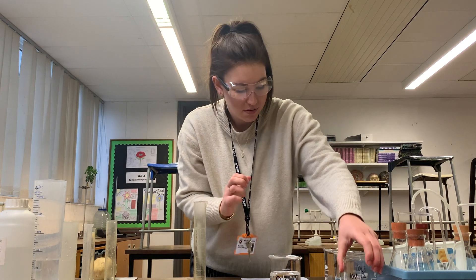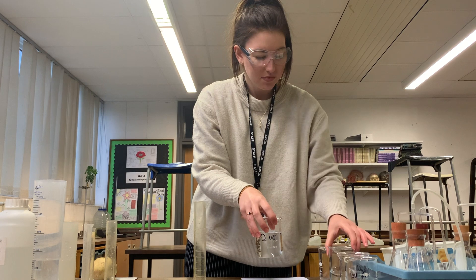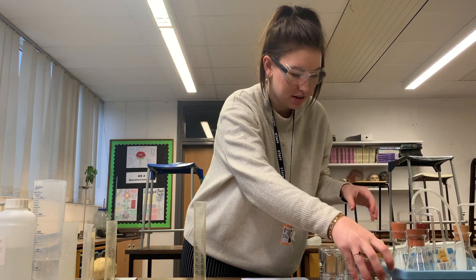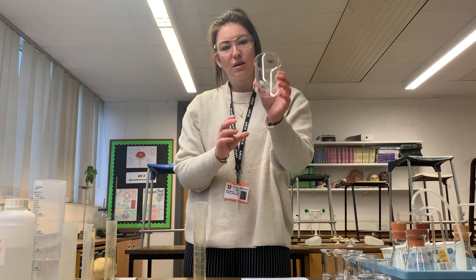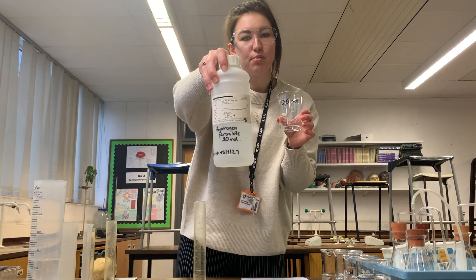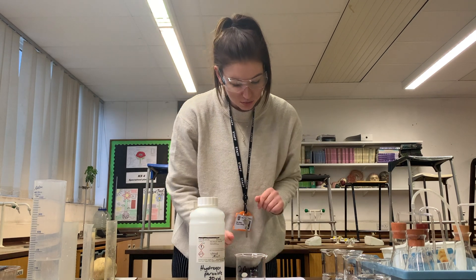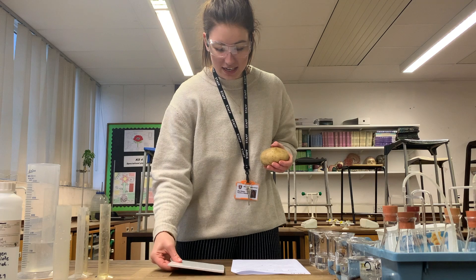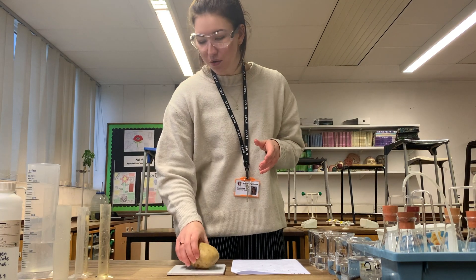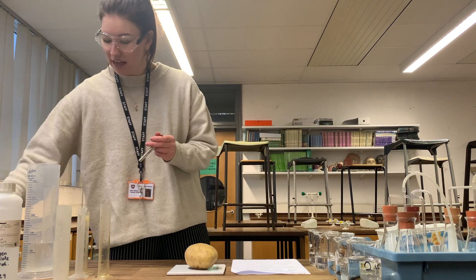So that is all of our solutions in the dilution series. What we now have to do is fill our 20 vol beaker — which will just have the 20 vol hydrogen peroxide — and we need 100 centimetres cubed of that. Now we need to get 5 cylinders of potato using a cork borer and then make sure they are all the same length.